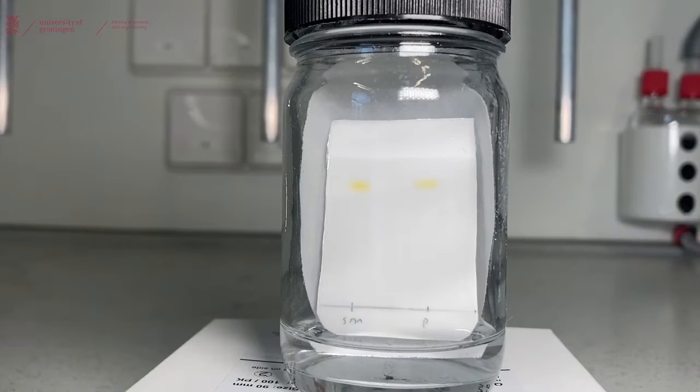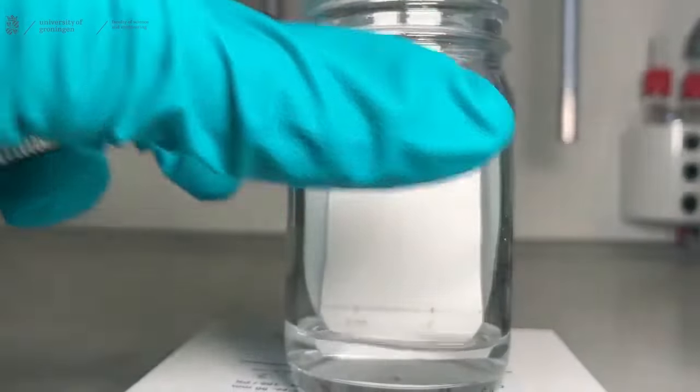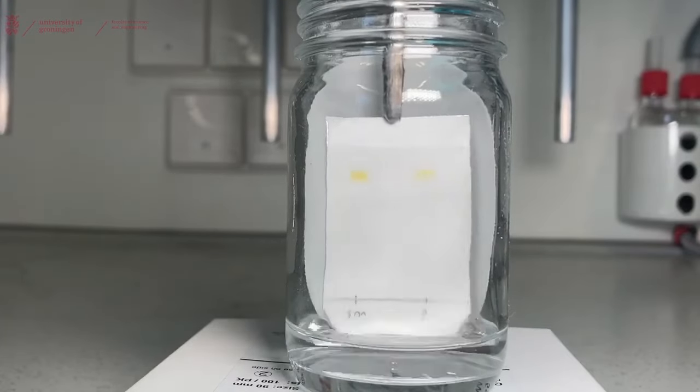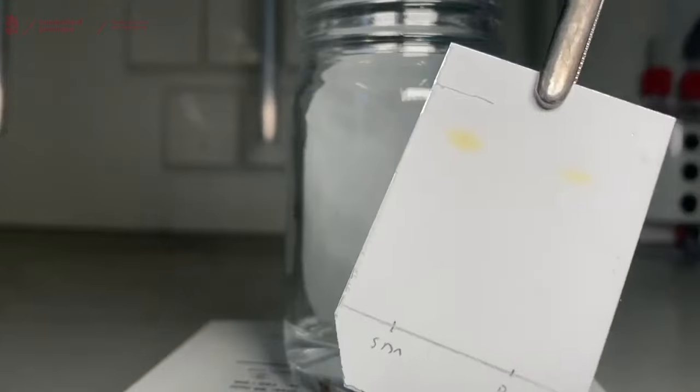We're almost at the end of our TLC plate. So we'll open the jar and remove the TLC plate from the jar using our tweezers. And draw a line at where the solvent reached the top. Now we just have to wait until the solvent evaporates.